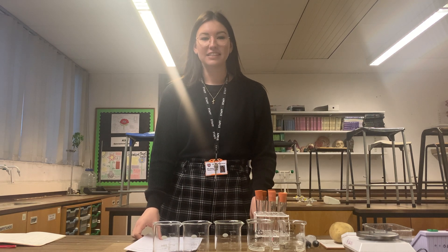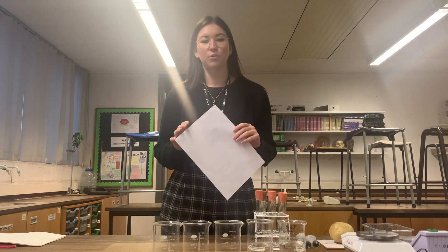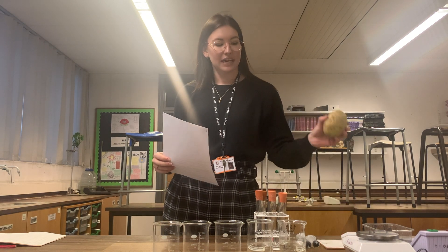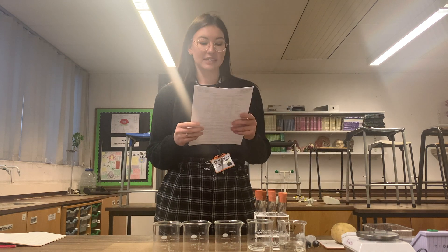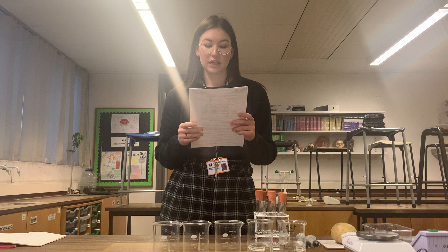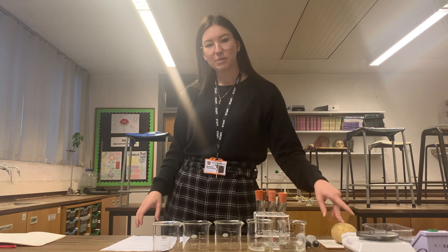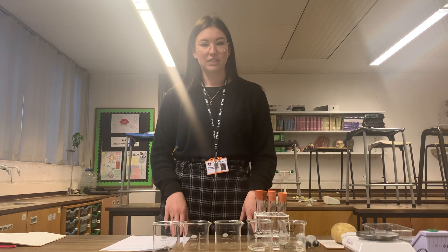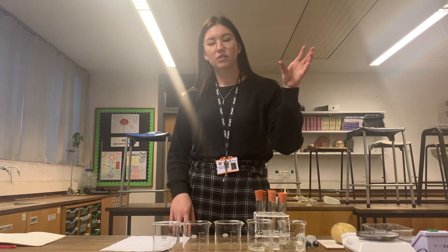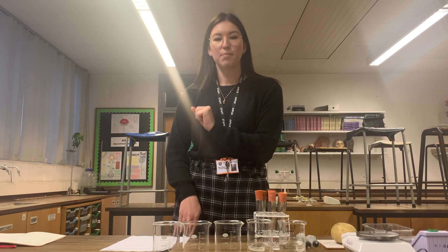Hi guys, so this is PAG 8.1, which is an investigation into the water potential of a potato. I have a potato, and by putting that in different concentrations of sucrose solution, we can determine the water potential of this potato. Remember with osmosis that water will move from an area of high water potential to an area of low water potential across a partially permeable membrane.